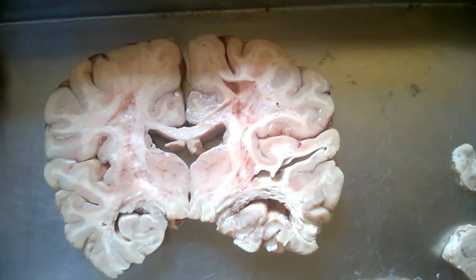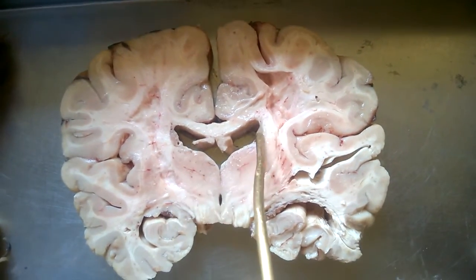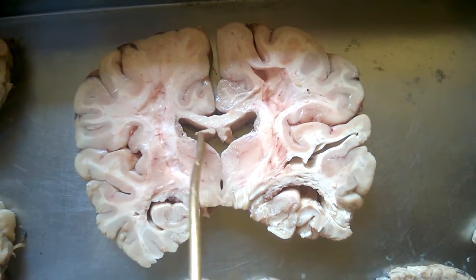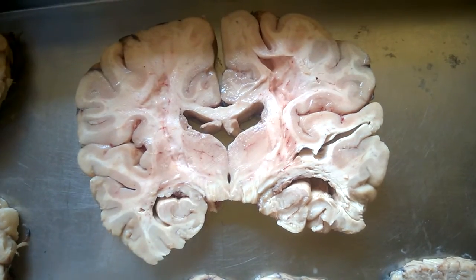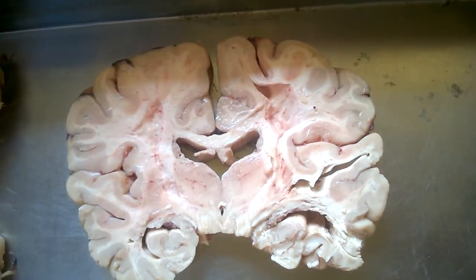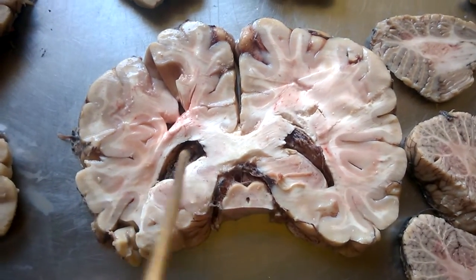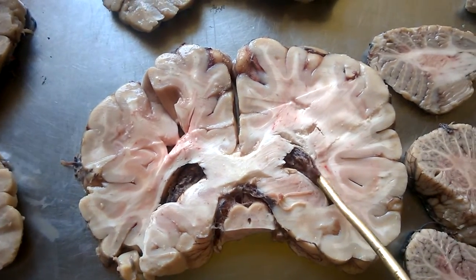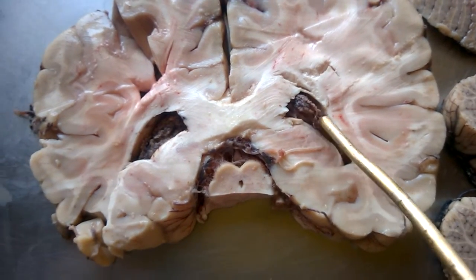As we go backwards, we can see the caudate nucleus has become very small, difficult to visualize. And this large structure that we see now is the thalamus. Remember, the caudate nucleus is always in relation to the lateral ventricle, and the thalamus is always in relation to the third ventricle. And as we go back, this is the posterior horn of the lateral ventricle, and the structure we see here is called the choroid plexus. The choroid plexus is what produces the cerebrospinal fluid.